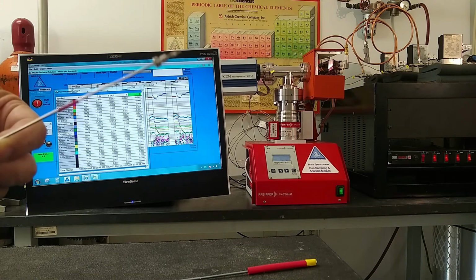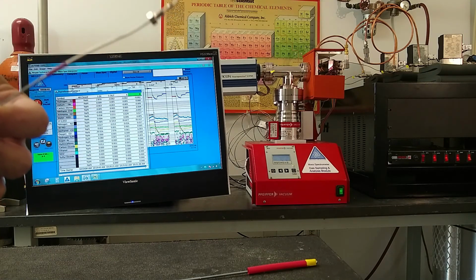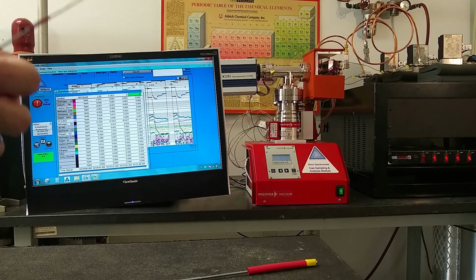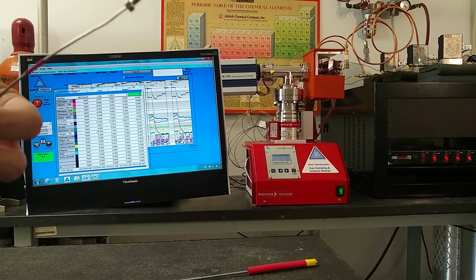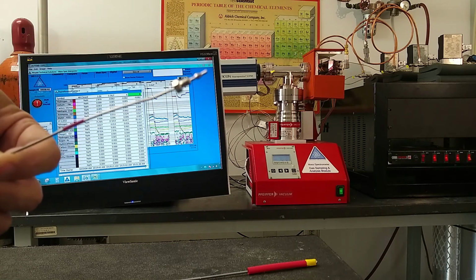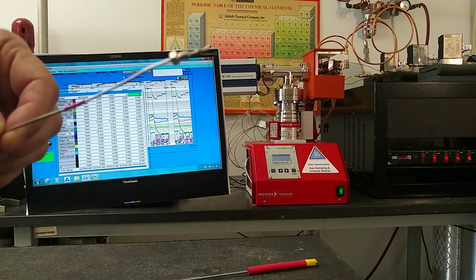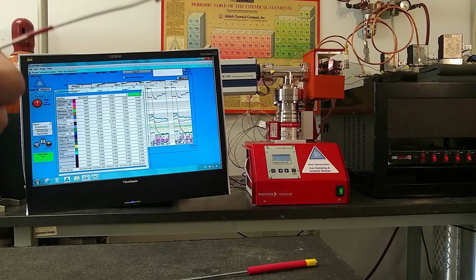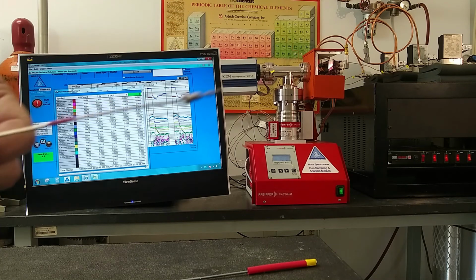The capillaries can come in different materials and may have different coatings. Dr. Ellefson has an excellent presentation discussing his analysis of various capillaries in various applications, and I would urge you, if that's of interest to you, to get a hold of us, and we'll get that information to you.